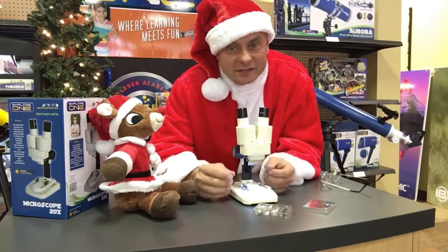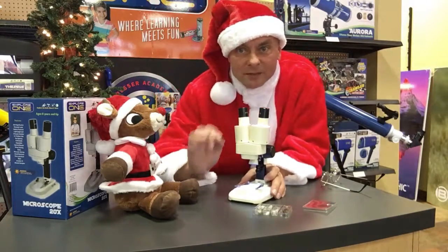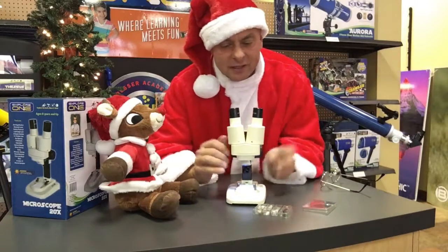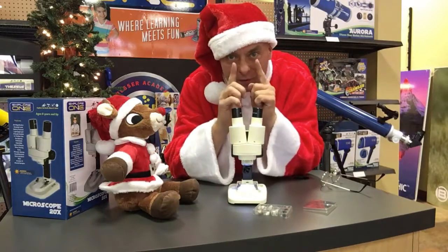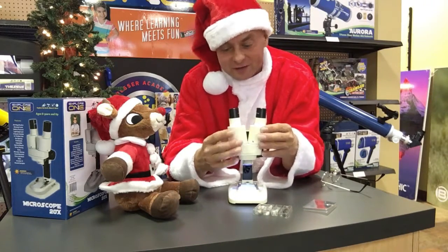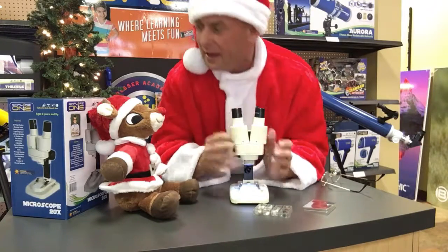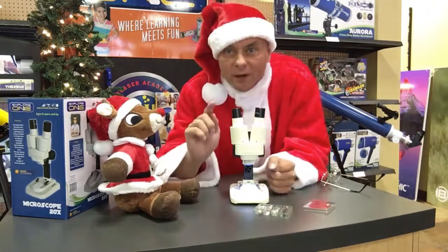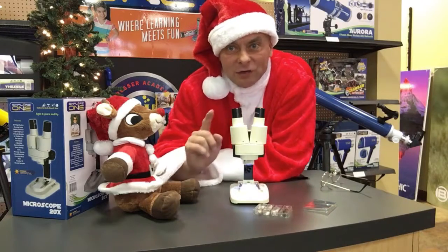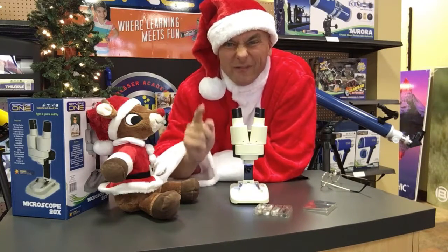Parents, if you're watching this, you're going to find out that this is a fantastic device — gives great images, really sharp images, and can adjust to your child's interpupillary distance as well as an adult's. So we do have a lot of adults buy this as well. It's all from Explore One, and you can find it at exploreone.com. You can use the discount code ScienceSanta to get a 25% discount. So go now.